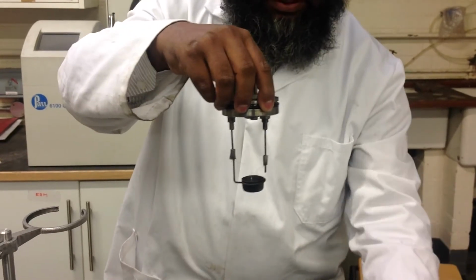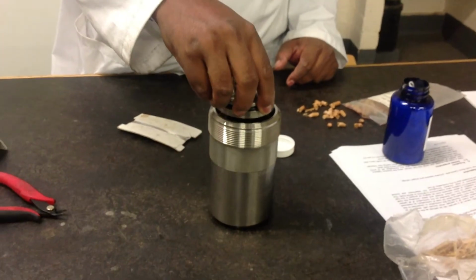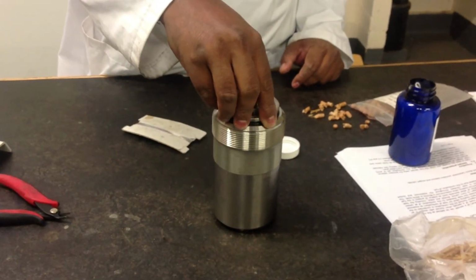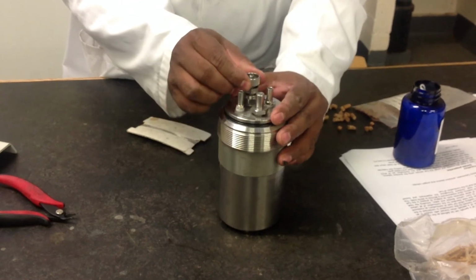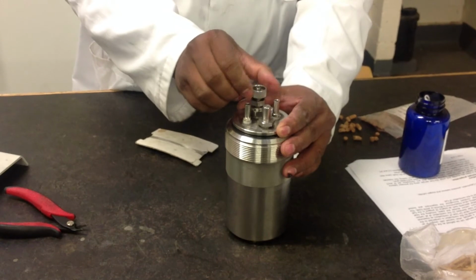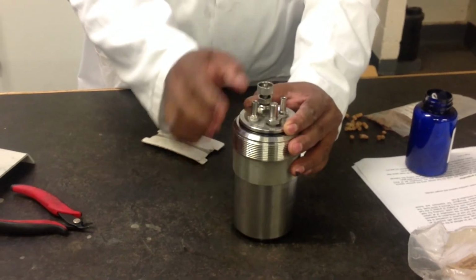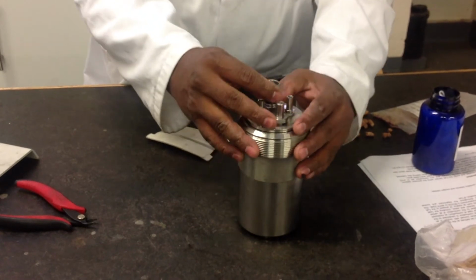And then place this head into this container slowly and gently, and make sure this small screw, the gas release valve, is open, and then push this down gently.